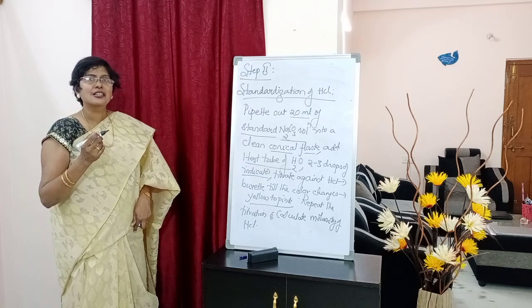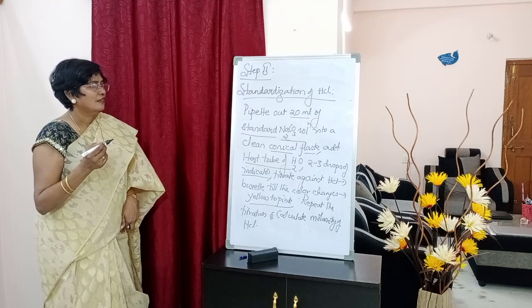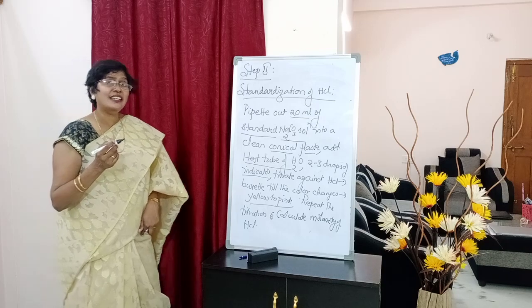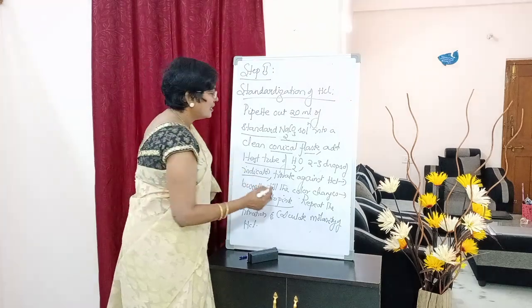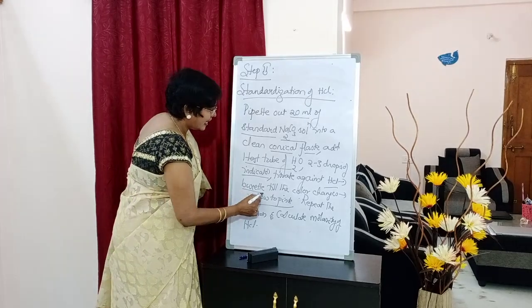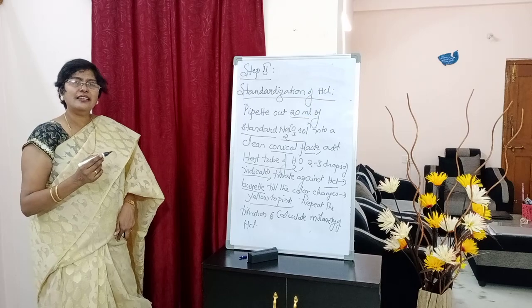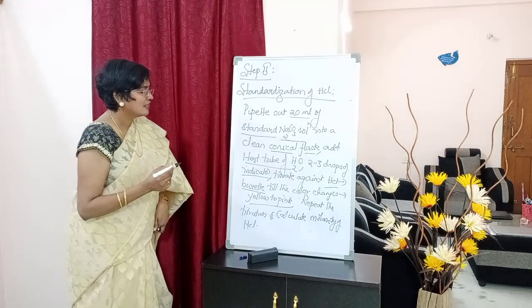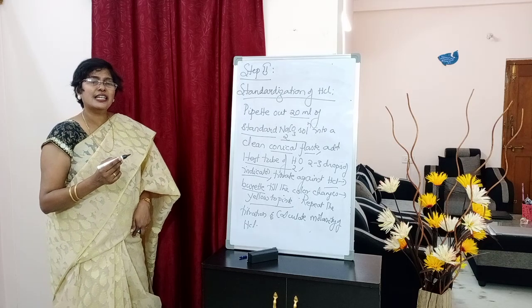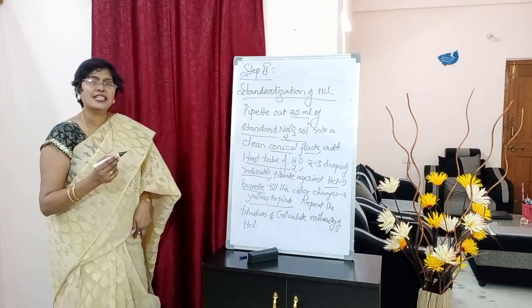Methyl orange. 2 to 3 drops of indicator, titrate against HCl taken in the burette till the color changes from yellow to pink.